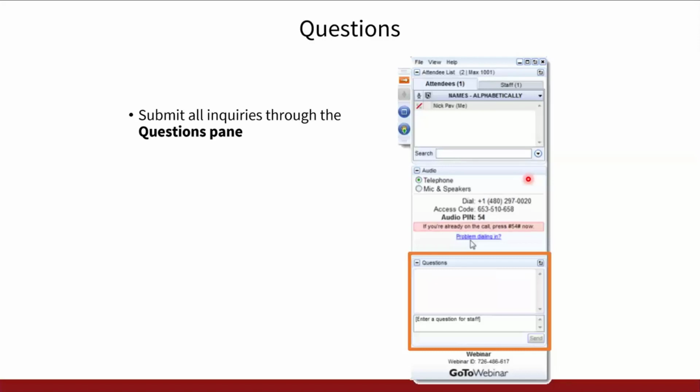Yeah, so that's a great question. In these two works here, those are taken using a One-View camera that we have here at Stanford. It's a 4K by 4K CMOS type camera, but it's not a direct electron detector. So the dose that's required to obtain a high resolution image there is a bit higher than what you would get on a direct electron detector. So the dose used in those TEM images is approximately 1,000 electrons per square angstrom.